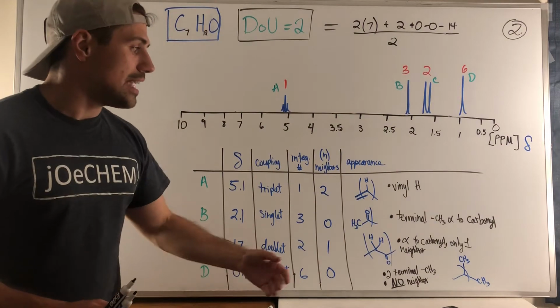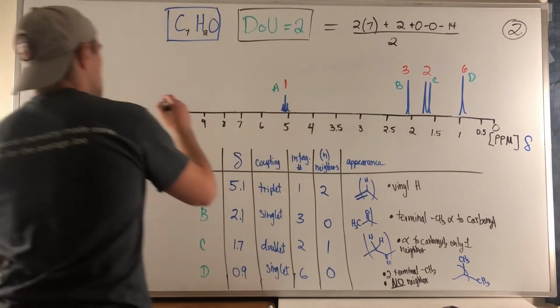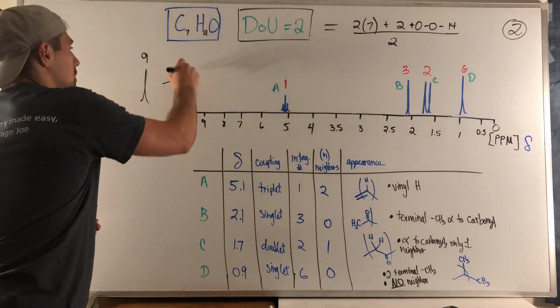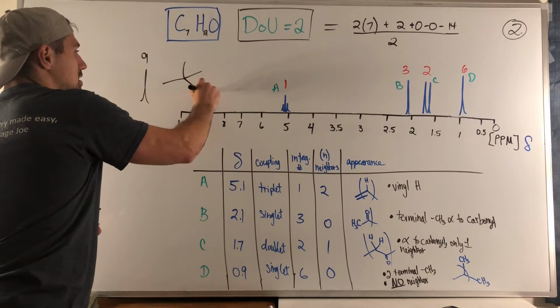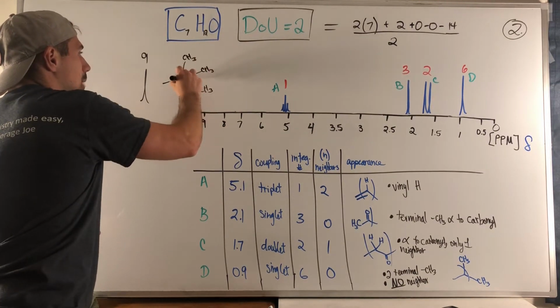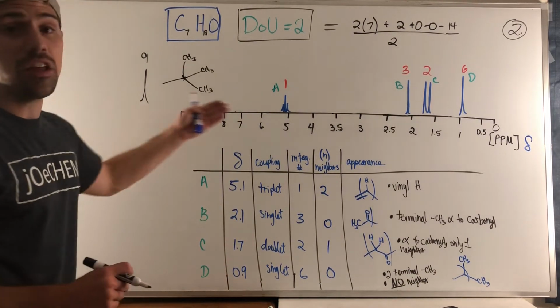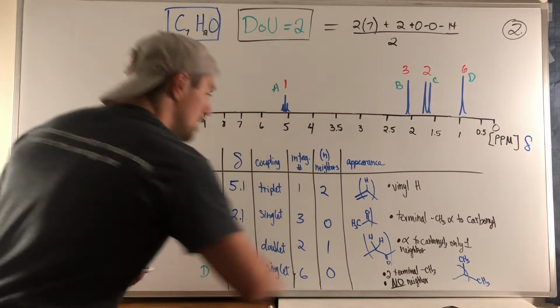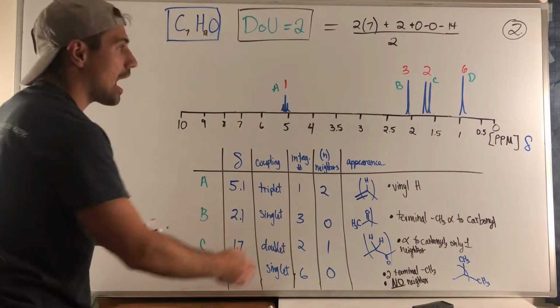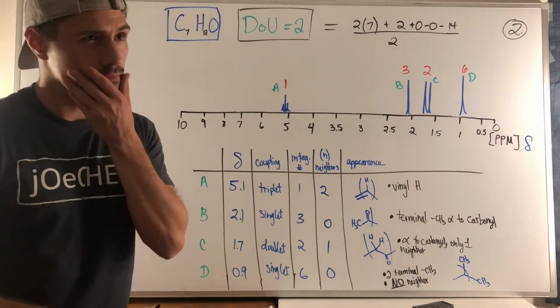Very commonly you would see something like this, and this is like a T-butyl group, because you need a CH3, a CH3, and a CH3, and then right here by default that's a quaternary carbon that has no hydrogen, so that takes care of the singlet splitting pattern. However, interestingly enough, we have only 6 hydrogens for our integration number for D, but we have no neighbors.